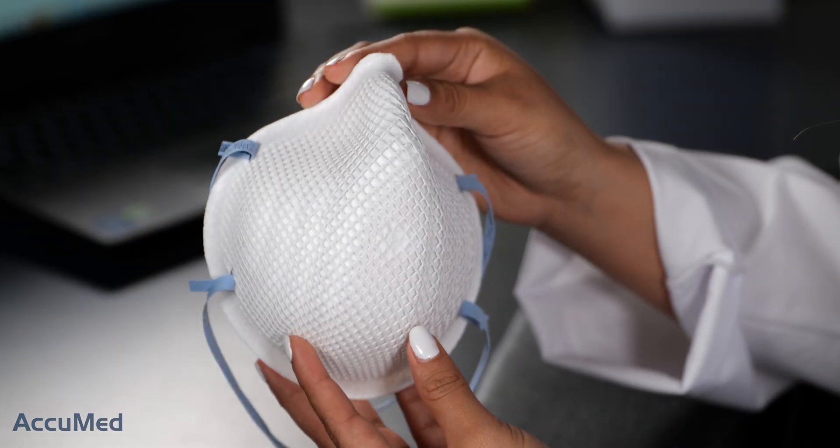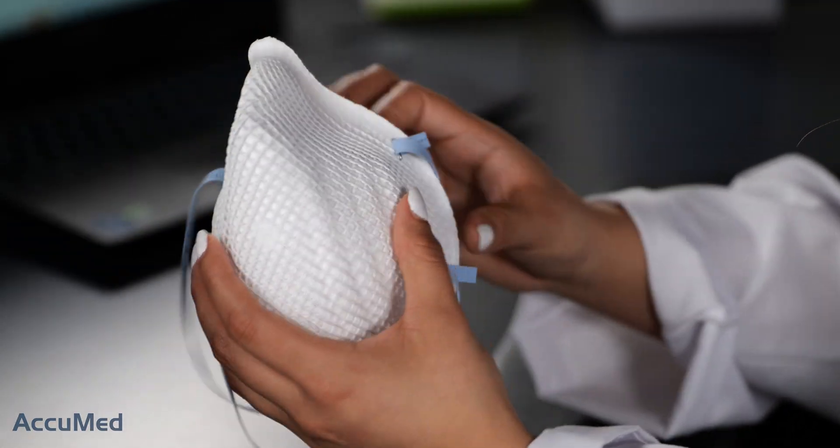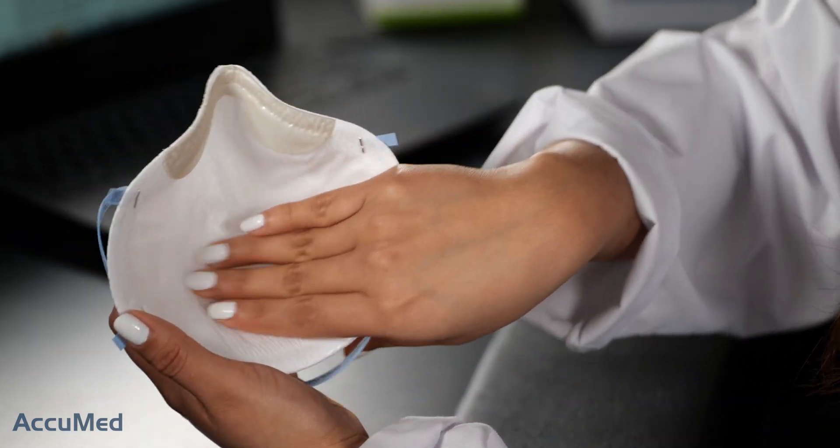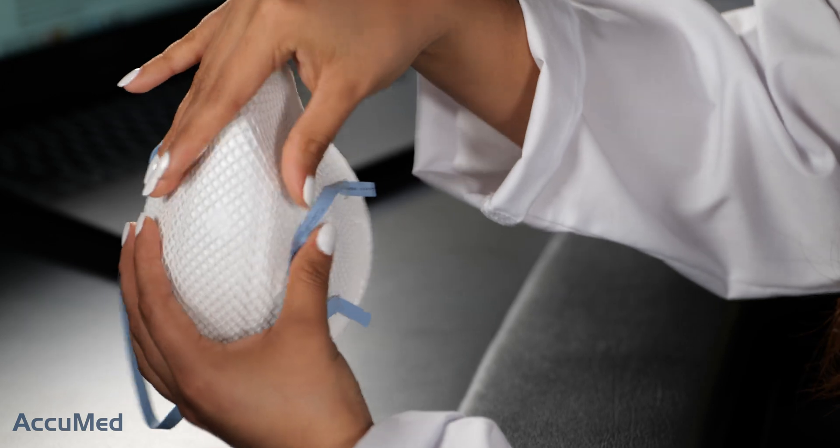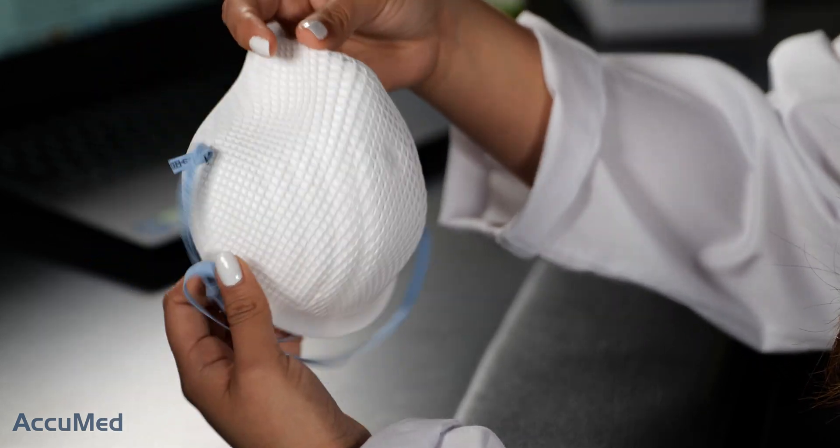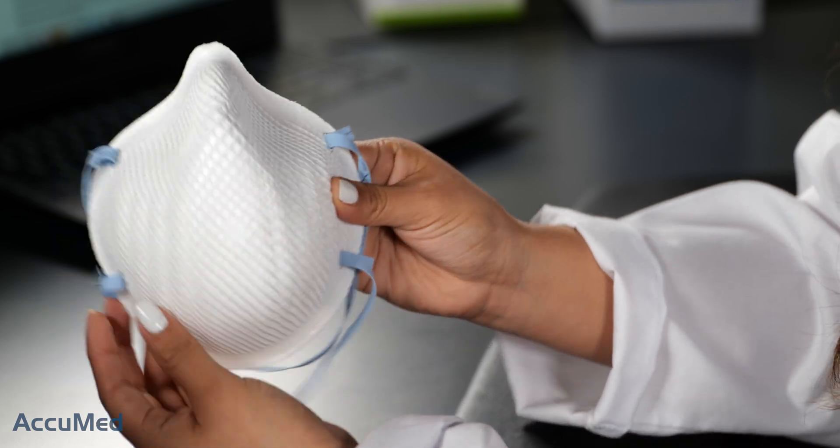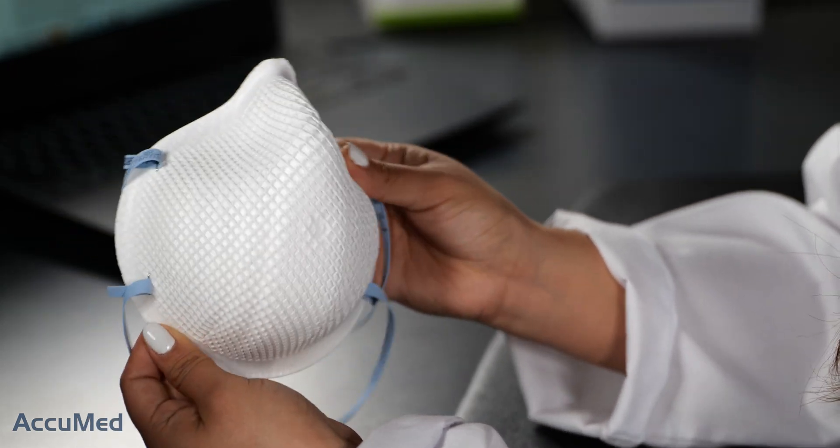This is how the N95 respirator looks. It is a mesh design. This is how it looks from the inside. It is a pretty soft material from the inside. The quality of this is actually a pretty high construction quality. It feels more like an industrial mask design, something that you would usually wear at a chemical plant setting.